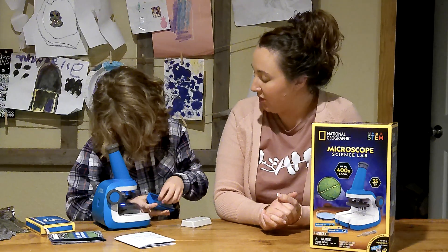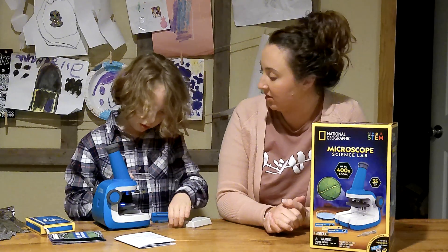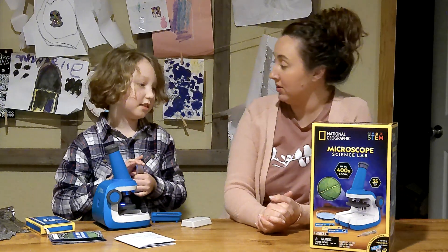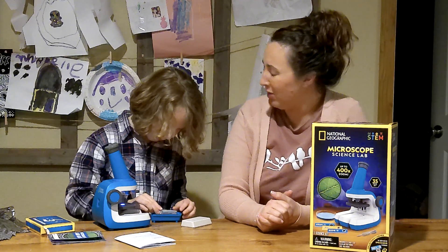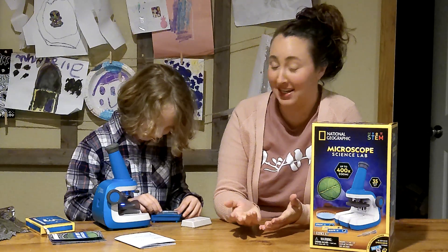What are some things you think you're going to put in your samples? Yogurt. Yogurt, that'd be a good one — we can see that good bacteria. What else? Some lettuce. That'd be cool. What about some gunk off your feet maybe?